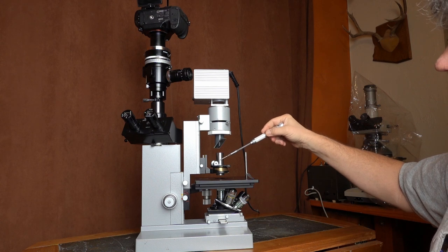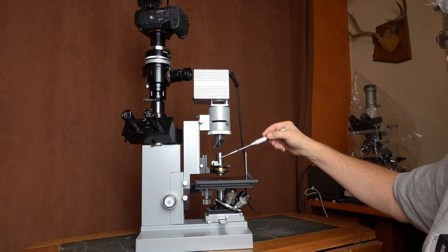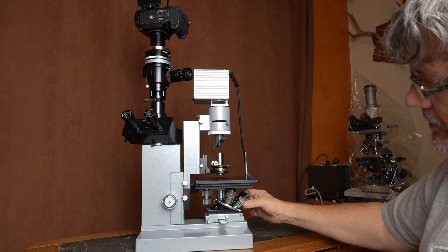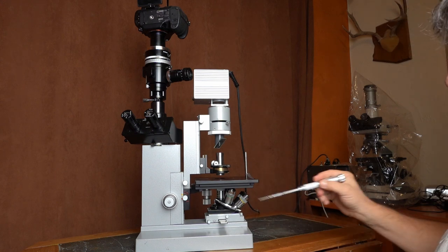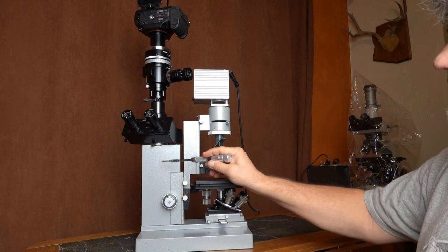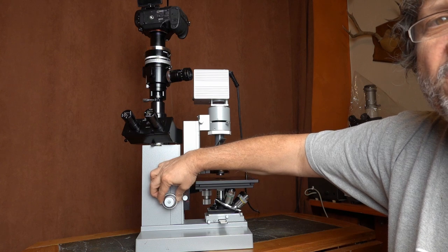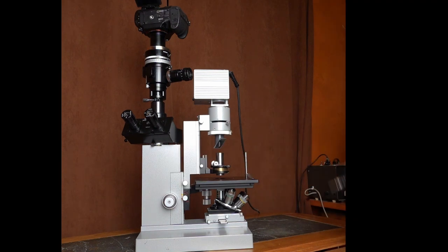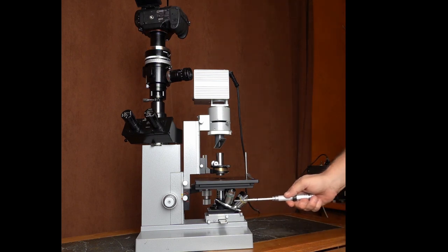The light from the light box comes down, hits the condenser — in this case the Heine condenser, an absolutely phenomenal condenser — goes through your slide on the table, through the objective you've selected by turning the nosepiece and waiting for the click. Then it comes down through the relay optics, which are only there for an inverted microscope, and comes up to the eyepieces. There's a coarse focus knob and a fine focus knob for very precise focusing.